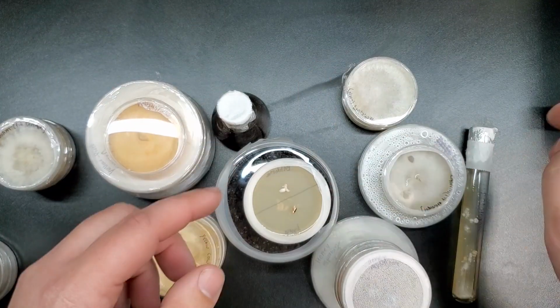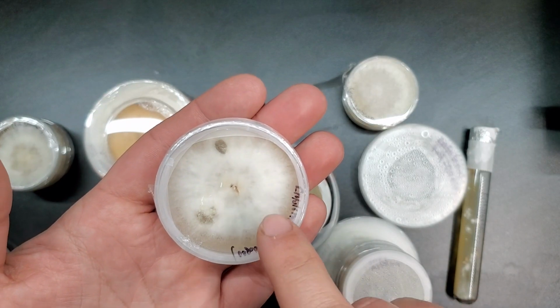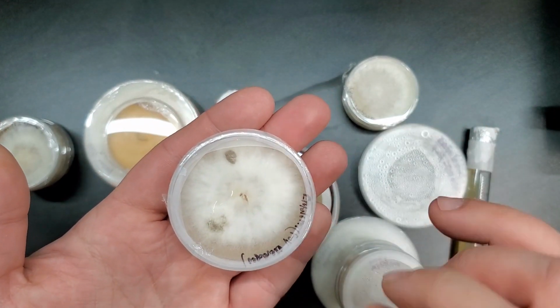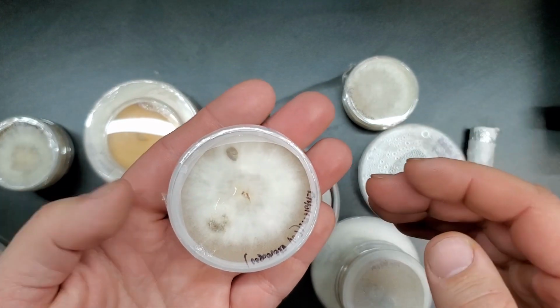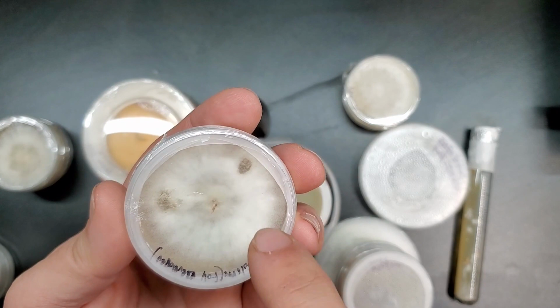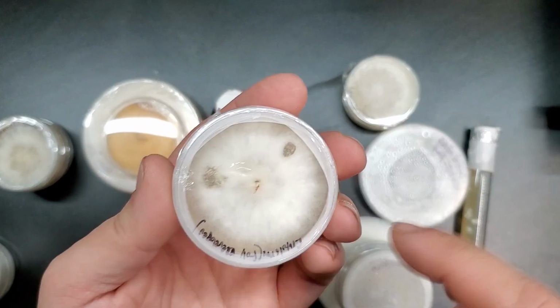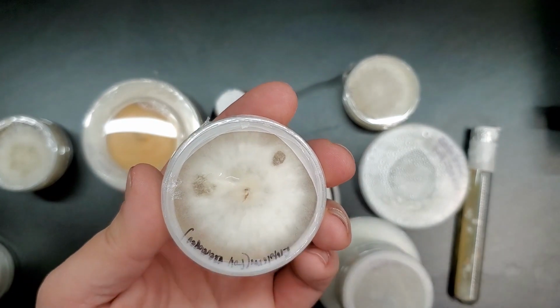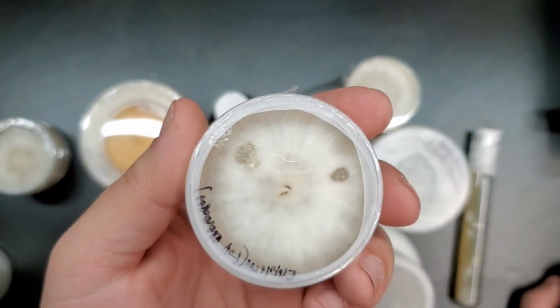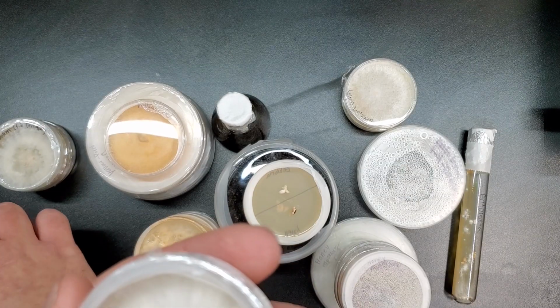But this is the point I wanted to make, and you probably already saw it down here. This is one of the original petri dishes from the fully developed Entoloma abortivum mushrooms, the mushroom fruit body. And look, the fully developed tissue sample is also by itself. There's no honey mushroom or Armillaria tissue in this sample whatsoever. It is also putting off these aborted nodules. Like I said, this is from the fully developed fruit body.